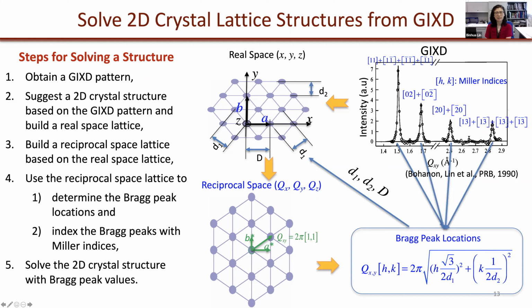Many a time, when you compare it, you find out it didn't match. That means the structure you suggested is not correct, so you start over again from 2 to 5. So that's the lecture. This part is concentrated on steps 2 to 5.